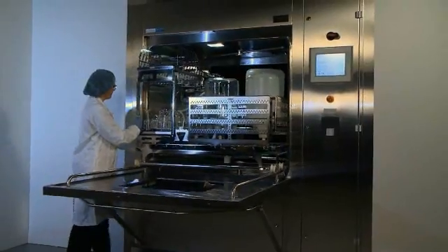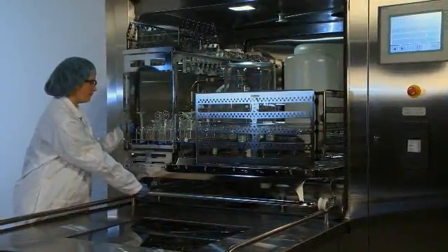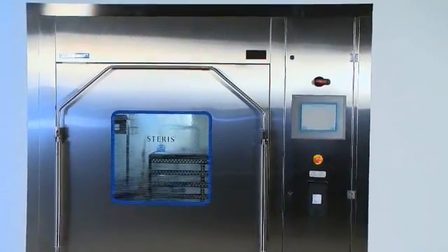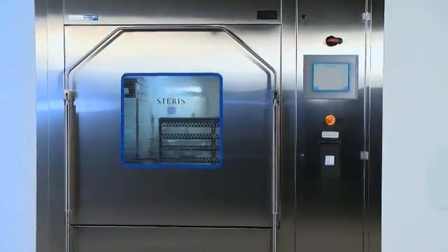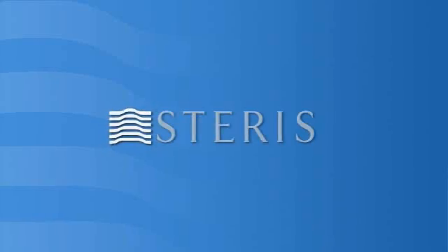The Reliance 680PG Pharmaceutical Grade Washer is a highly efficient and complete solution that can handle any component cleaning and drying challenges in your pharmaceutical manufacturing facility. When combined with Steris' unmatched global service capabilities and scientifically proven formulated chemistries, the Reliance 680PG washer has no equal. Productivity made simple from Steris.